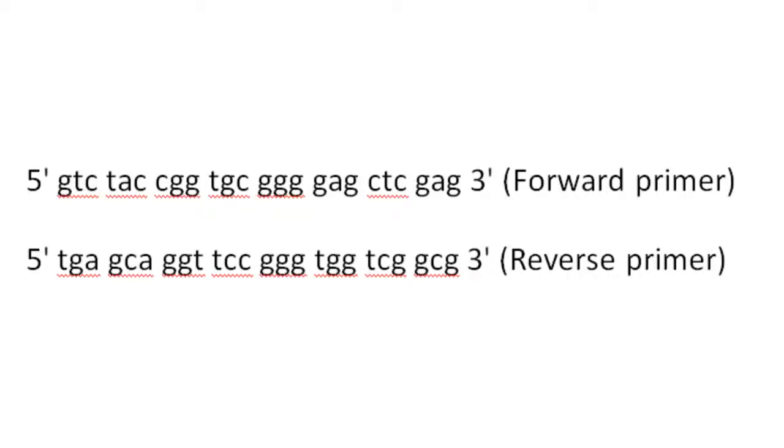So again, PCR is a very powerful tool, and I will make a video going behind the theory of PCR and what it actually is, and a whole review on PCR basically. There's actually a lot of information, and I'm not going to get into that right now in this video.